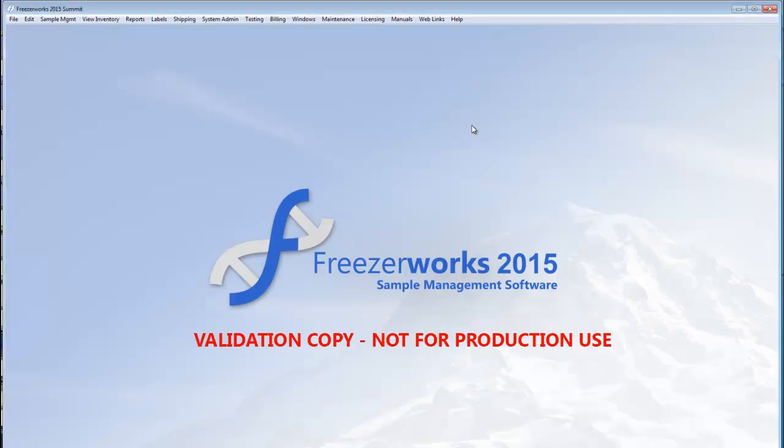Hello. Welcome once again to Freezerworks 2015. In order to start building our Freezerworks inventory, we must create some user-defined fields that we can eventually use on sample and patient entry forms.